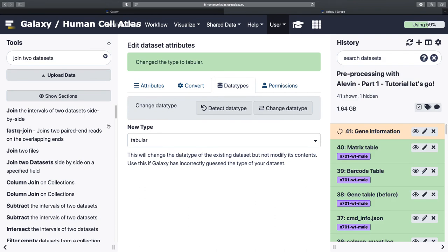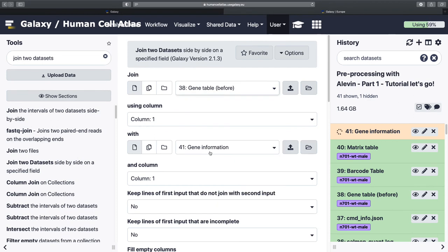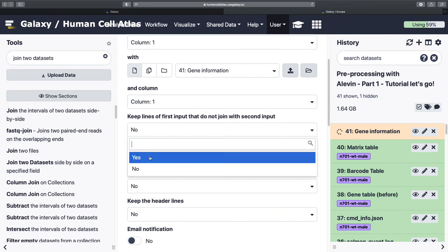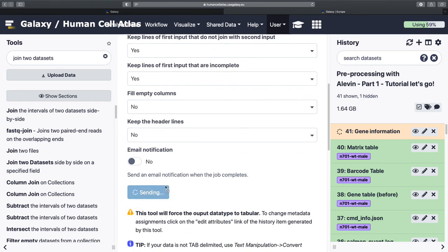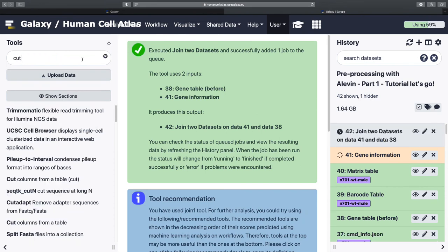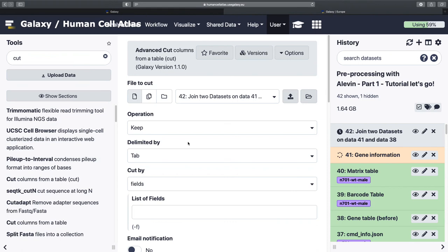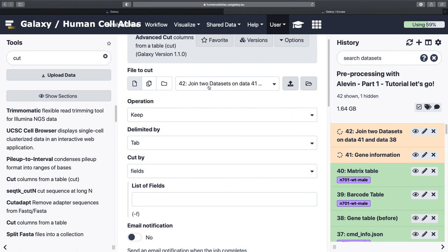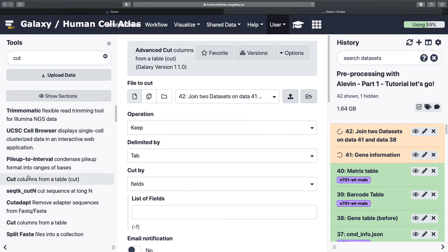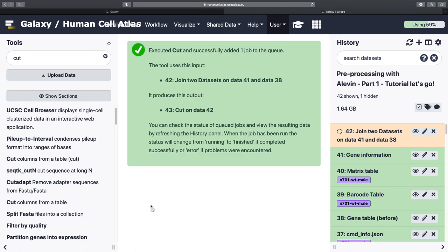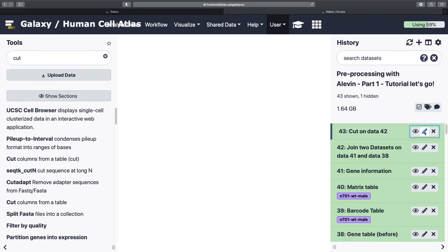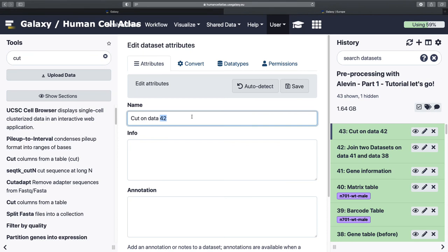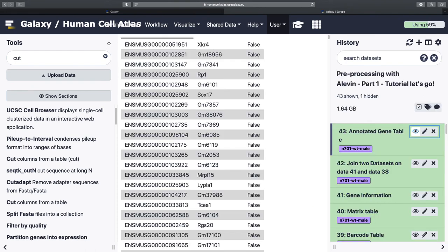We want our gene table, gene information. And then we want yes, yes, no, no. And then we also want cut. That's advanced cut. I don't want advanced cut. Hold on that one. Columns one, four, and five. So this is now our annotated gene table. And that looks a lot better. So this is now in the exact same order that our matrix is in. So now we can put the two together. So let's read it in.